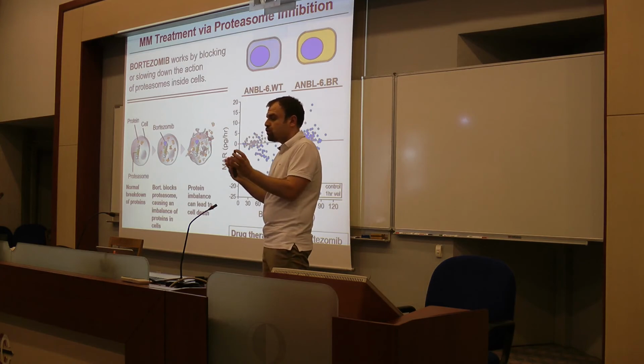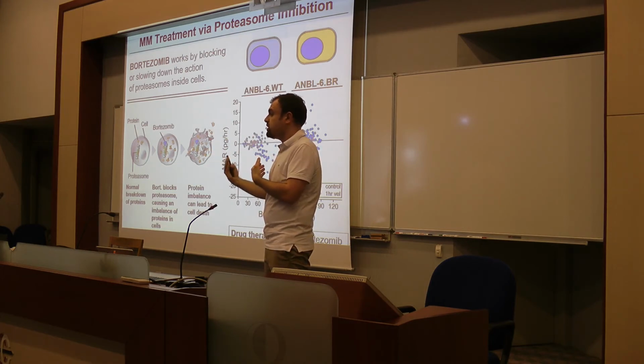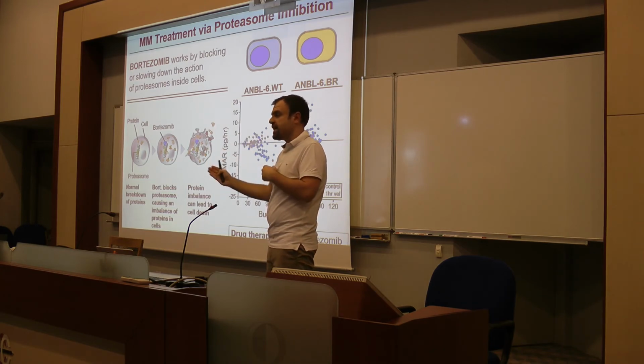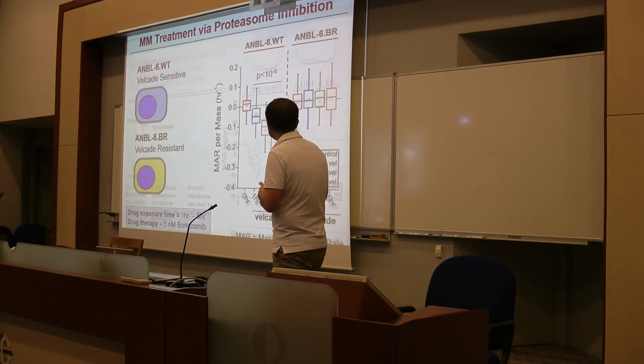This helps you directly see the effect of the drugs on the cancer cells. So it helps the clinician to decide whether a particular therapy works for these cancer cells or not. This shows that when you increase the incubation time, so here we drug the cells for 1 hour and increase from 1 hour to 5 hours, they die more. Here, the resistant one still shows no response.